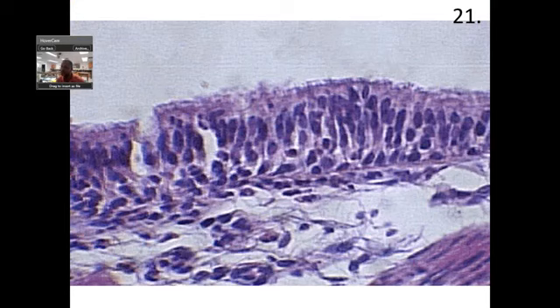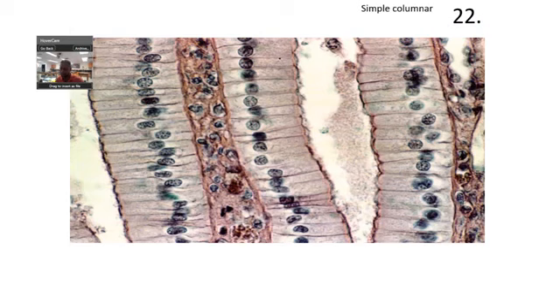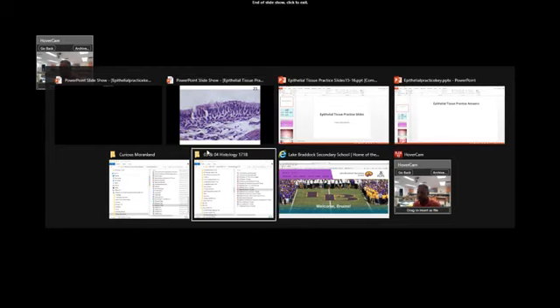21. Again, pseudostratified. And I'm going to switch to another PowerPoint in a second. So let's just look at another example of simple columnar. And that kind of ends that.